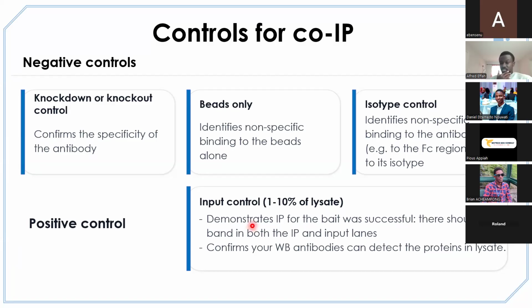We are expecting to see it, unless you decide to have a lysate whereby only protein A is expressed, and then a different lysate whereby only protein B is expressed. That one too is allowed. You can do so to set different experimental conditions.